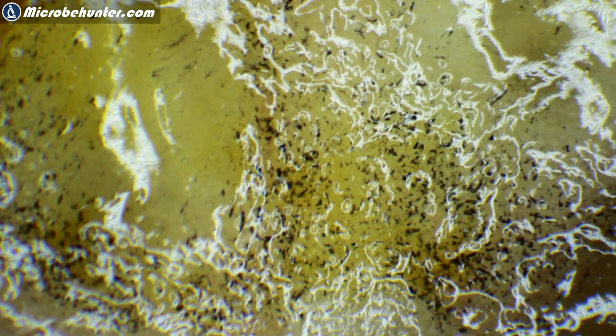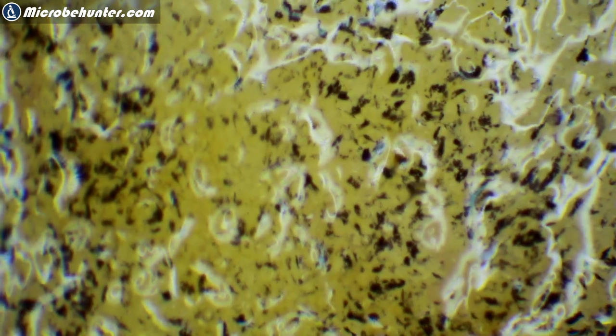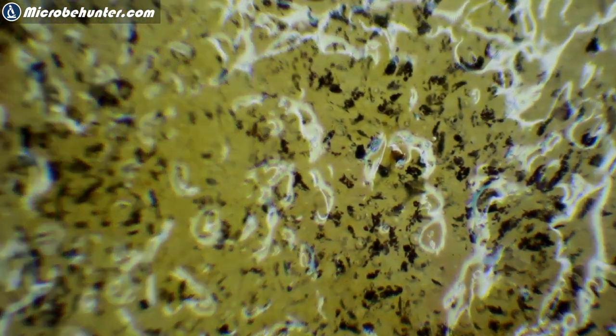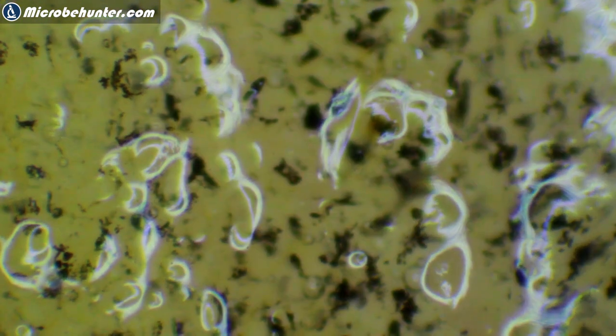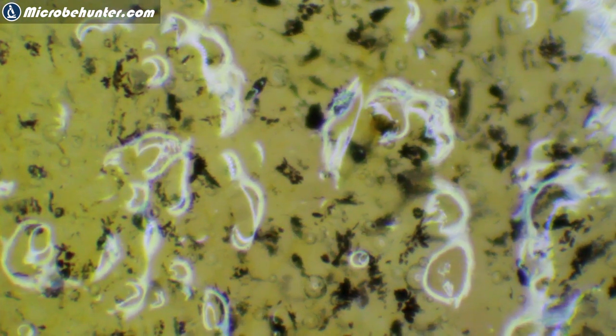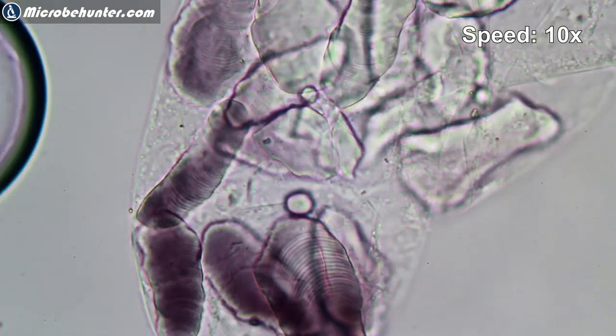Under my stereo microscope you can actually see those black dots much better. Zooming in a little bit here — and here they are, these starch grains. We'll also be looking at these under my compound microscope.